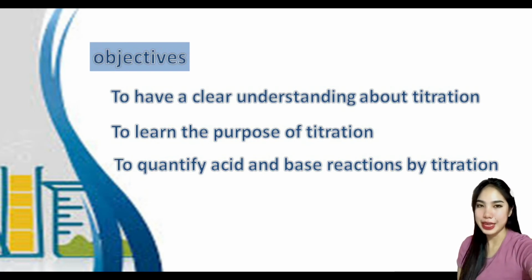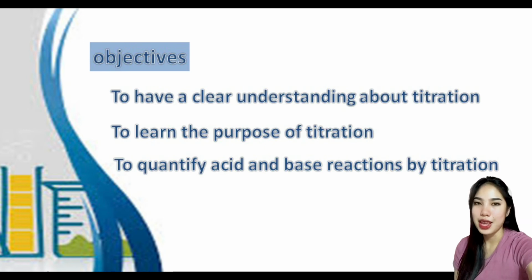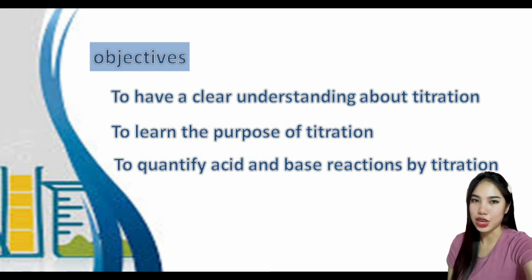So before we proceed, let us know the objectives of this presentation. The first one is to have a clear understanding about titration, the second is to learn the purpose of titration, and the last is to quantify acid and base reactions by titration. So without further ado, let's begin.